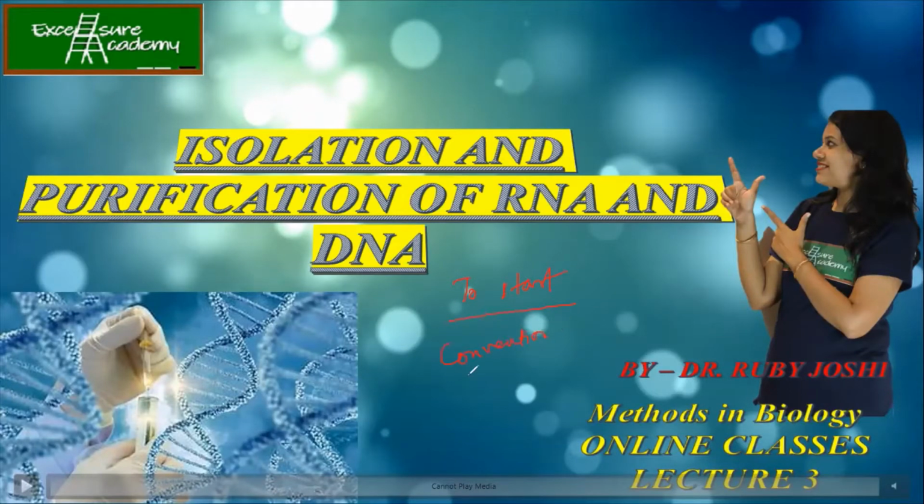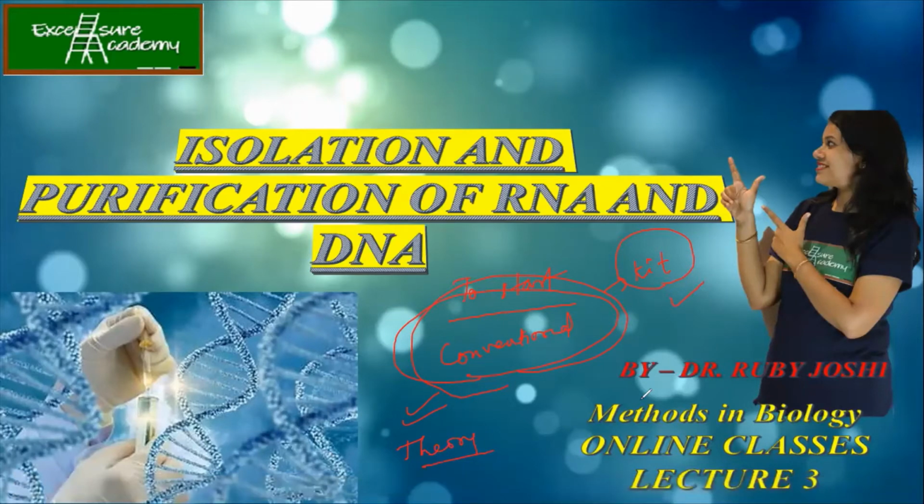Now, why we started with the conventional method, even though in companies and research labs we don't use the conventional method most of the time? We go with the kit, okay, and these kits are designed by the companies. So I'm going to discuss this as well, so that you are familiar with what kind of method is used in the research lab. And this conventional method I'm discussing so that the theory or the basic concepts behind the isolation and purification are clear. Okay, so today we'll be completing the conventional method, and then next lecture we'll be doing the kit method. So by these two methods you will be clear.